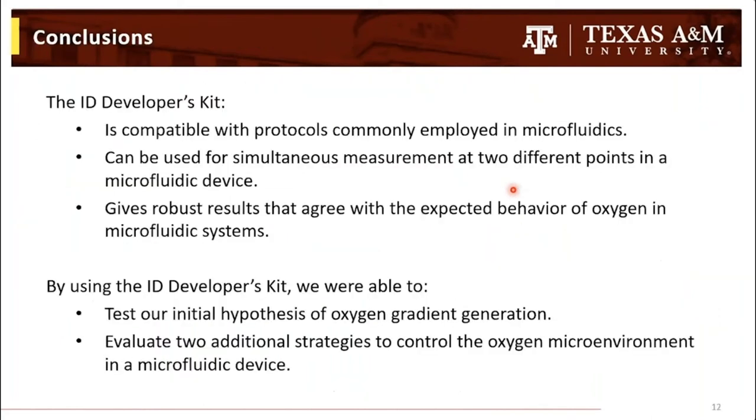With that, I would like to conclude that the ID developer's kit is compatible with protocols commonly employed with microfluidics, as we did not see an effect of plasma treatment and prolonged baking on the behavior of the sensors. The kit can also be used for simultaneous measurement at two different points in a microfluidic device, which was very convenient in our case. And the kit also gives robust results that agree well with the expected behavior of oxygen in microfluidic systems.